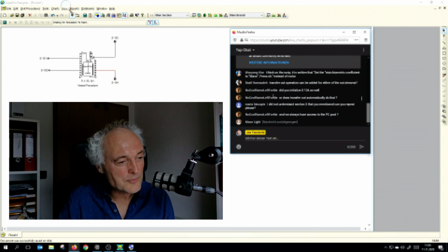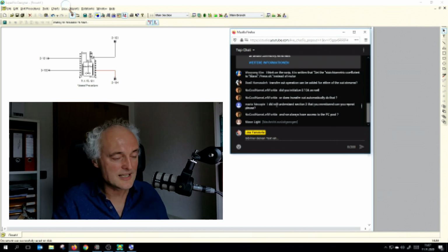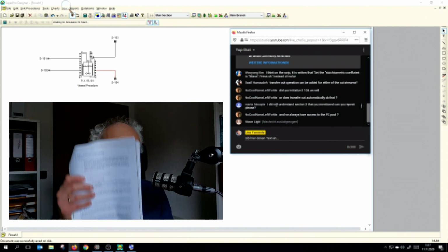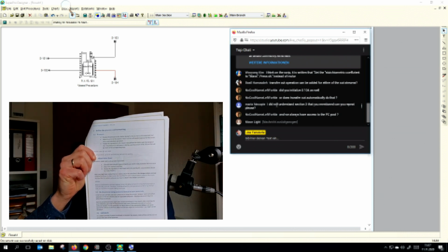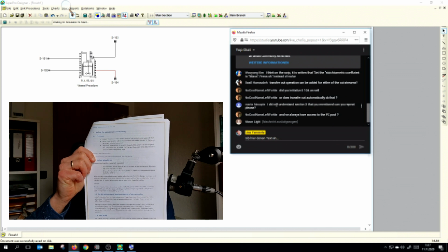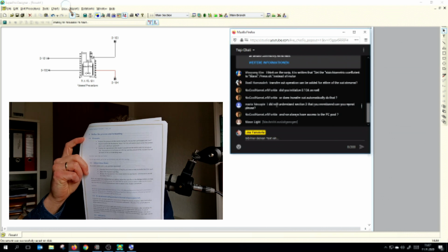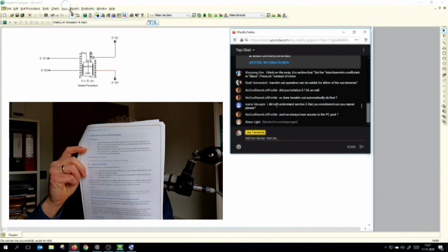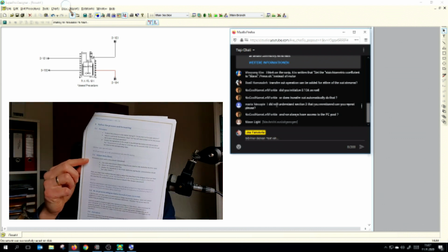Okay, so look. I didn't understand section 3 that you mentioned. So what I'm mentioning is based on the example sheet. So here, I'm just looking that it's in the camera. This is our example 1. And in section 3, refine the process and formatting. And you have here pressure, and you see what you should do. Analyze the pressure in the reactor. Do you feel comfortable with this? This you do after you have set up your own process, and then adjust the mass flow.